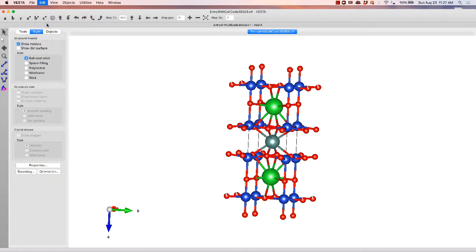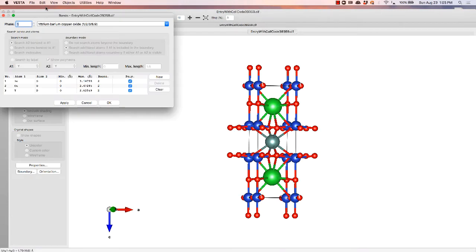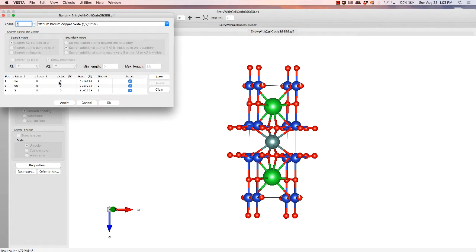So the next thing we're going to do is go up to edit bonds, and now that we have these bonds listed over here on the right, we can take a look at what it auto-defaulted to.